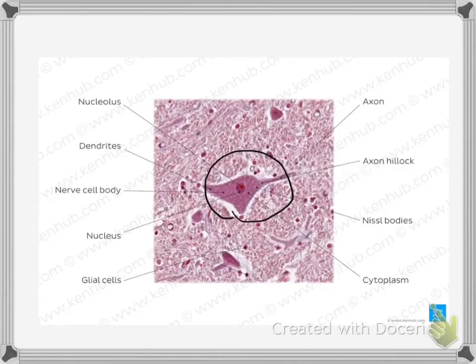Dear students, in this video we are going to read about the histology of nervous system. We have already learned about neuron, types of neuron and neuroglial cells under general anatomy. So, first thing, this slide shows the important one called neuron.